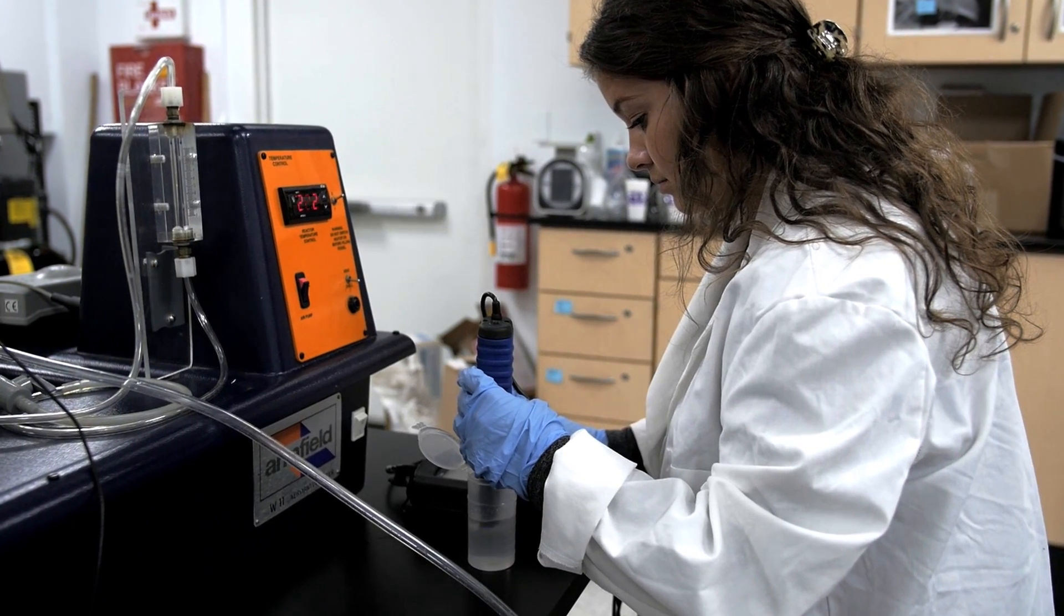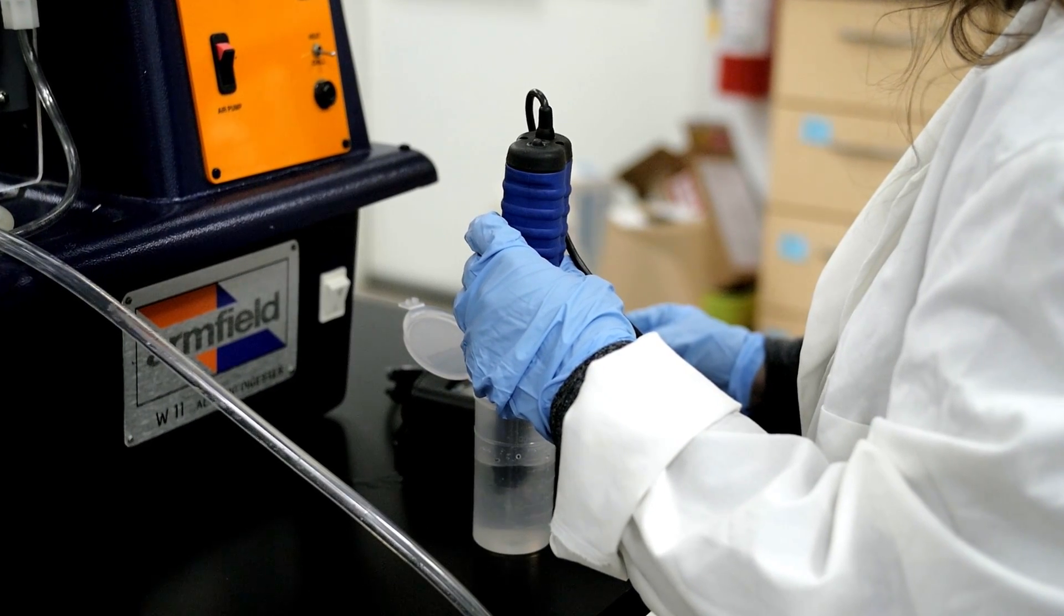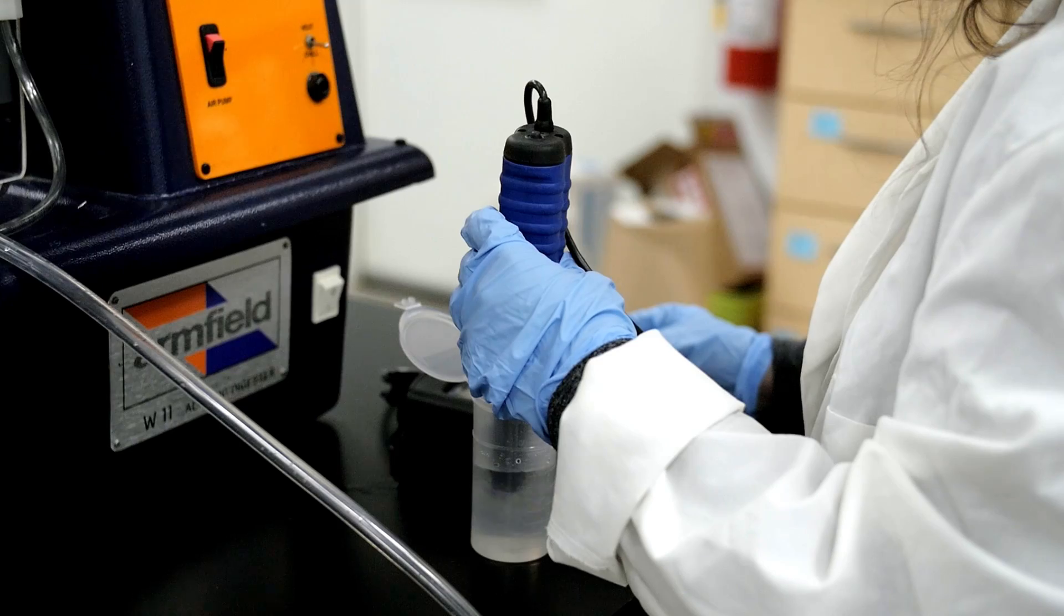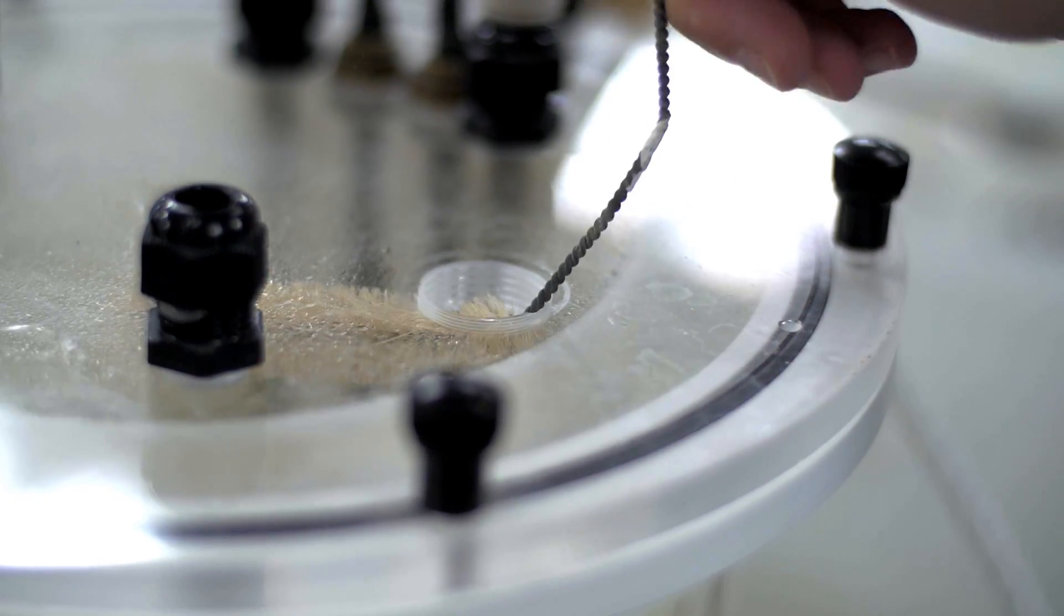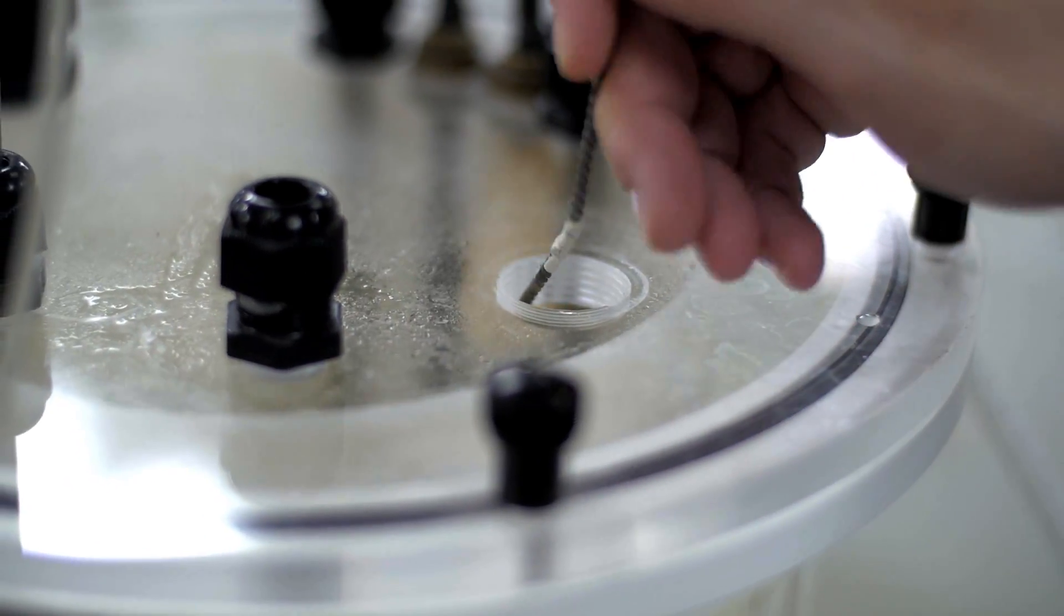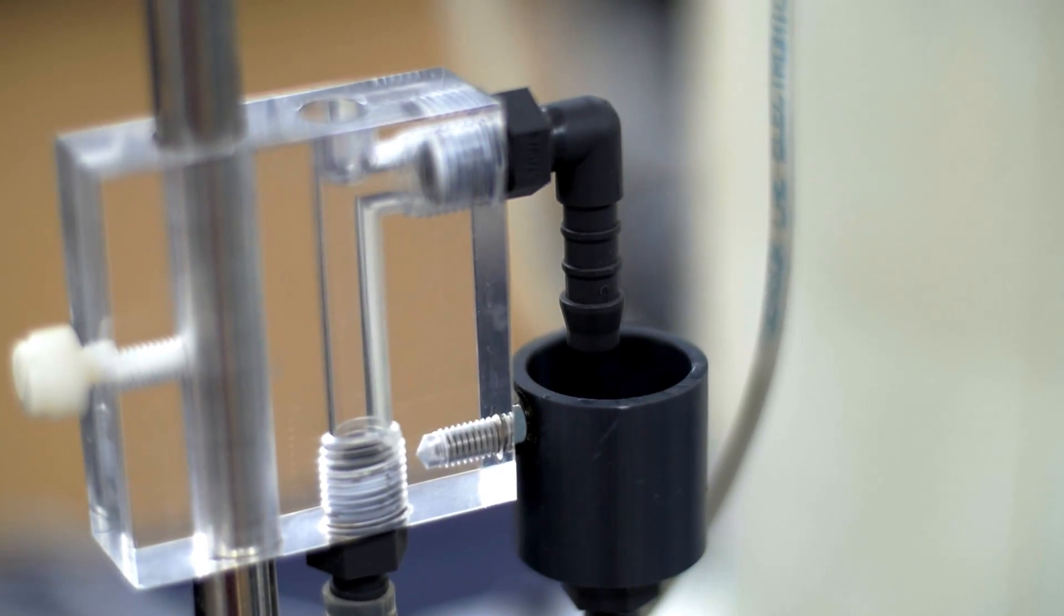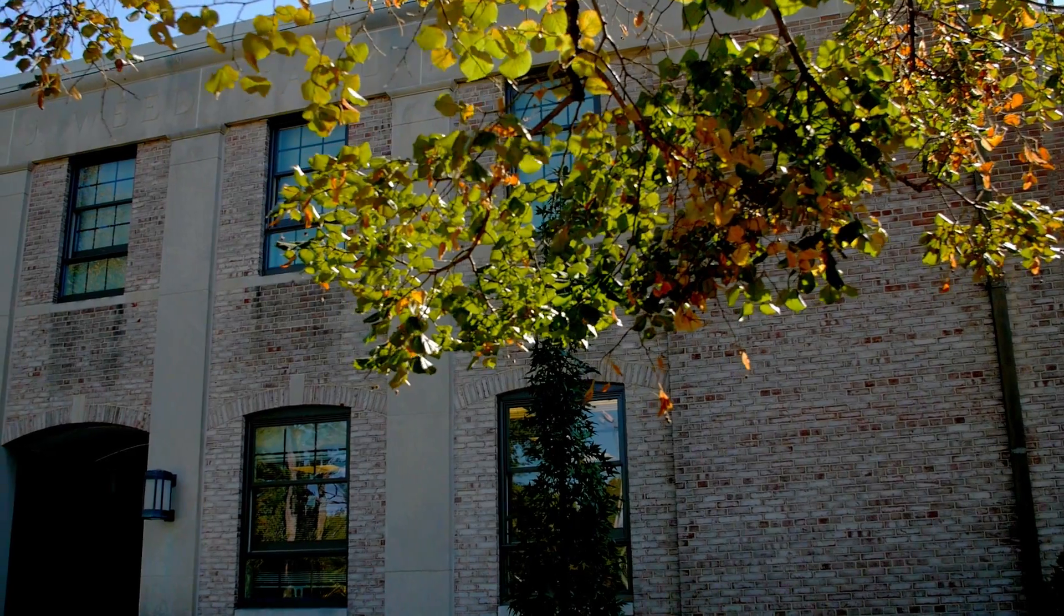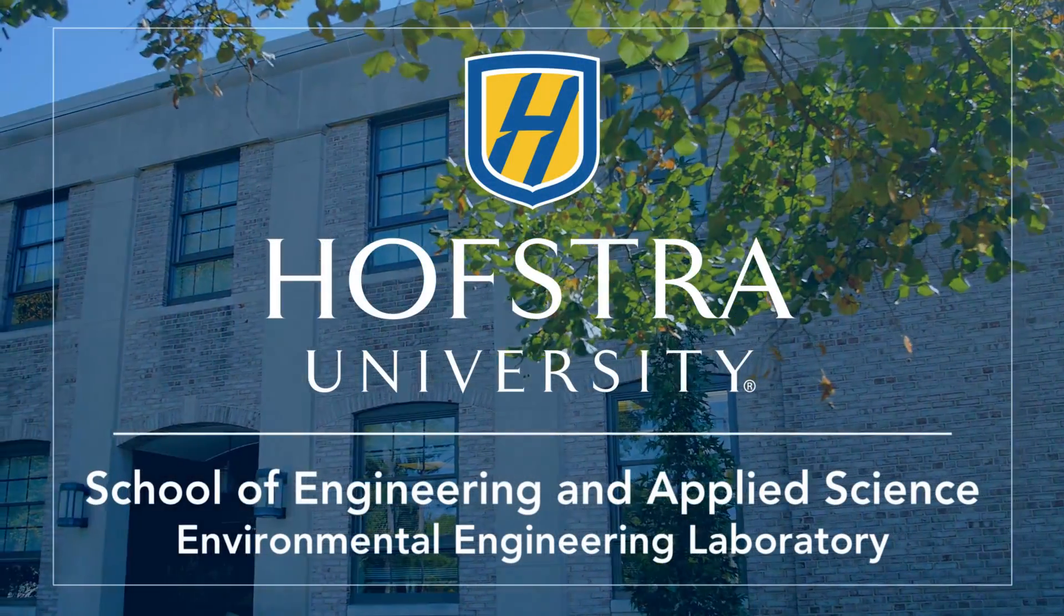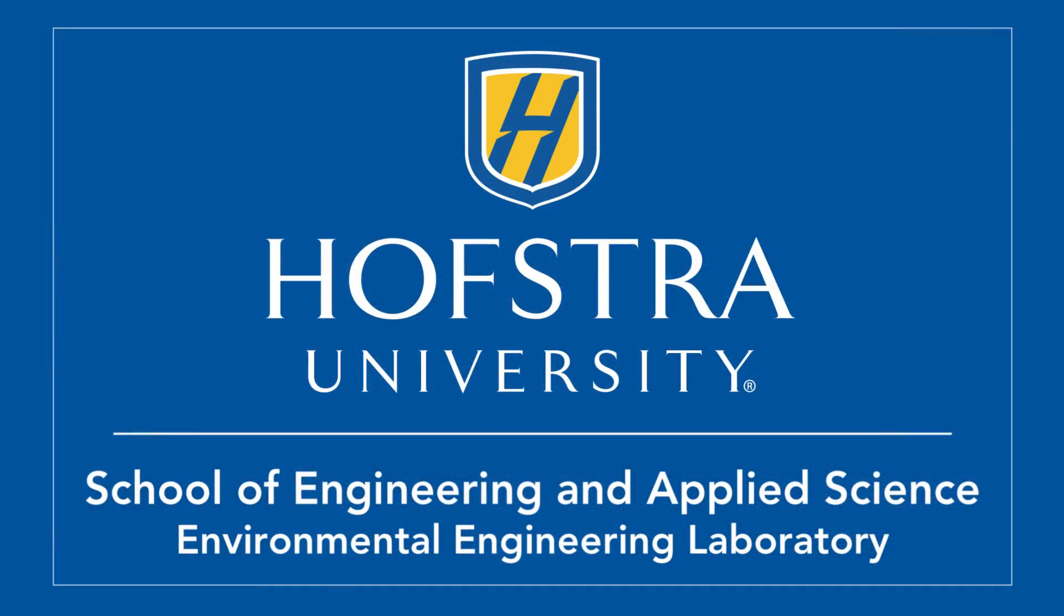Students use an oxygen probe to make sure there's enough oxygen in the water to break down the waste. They can also measure the amount of waste in the water by performing a chemical oxygen demand test before and after it passes through the unit.